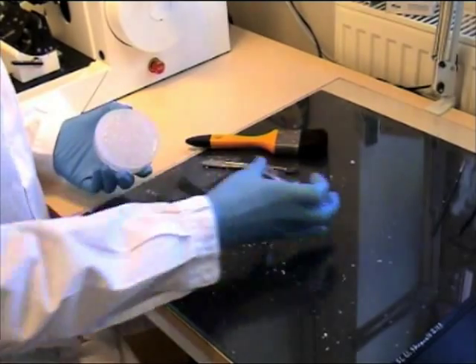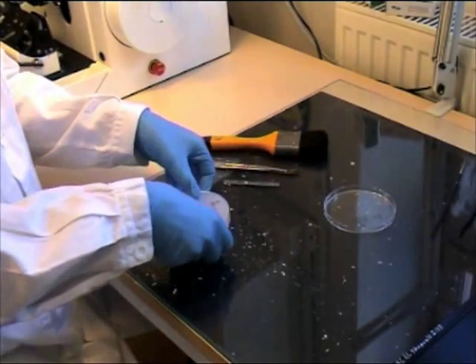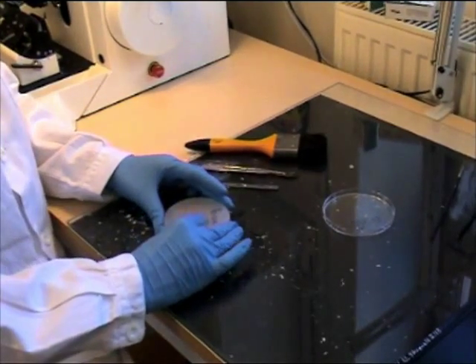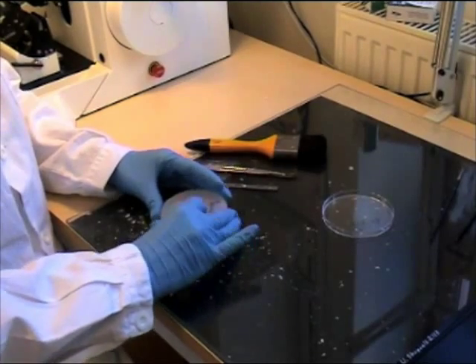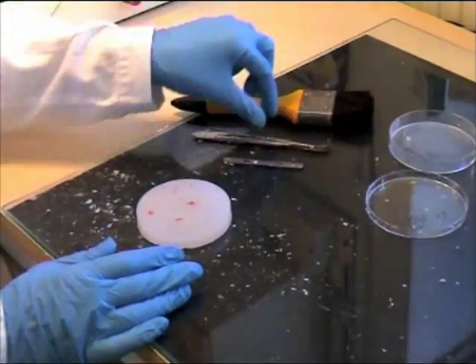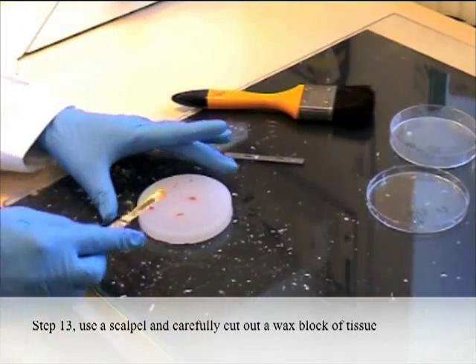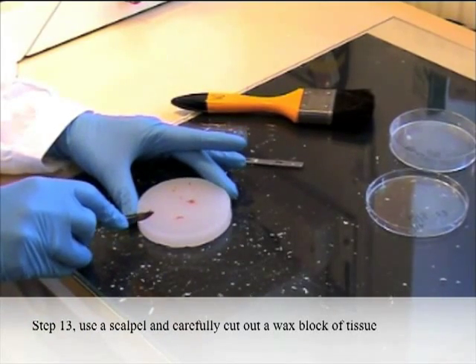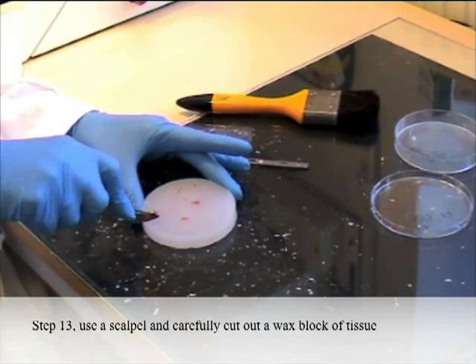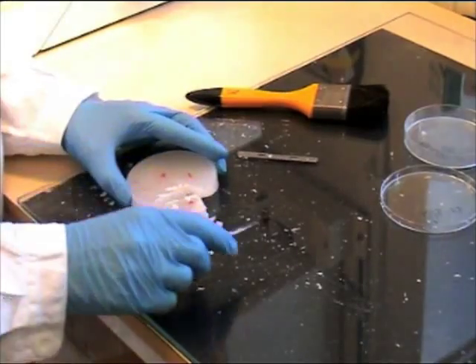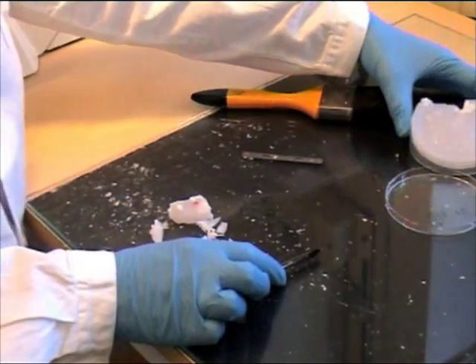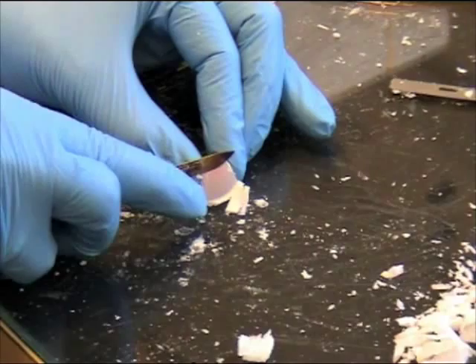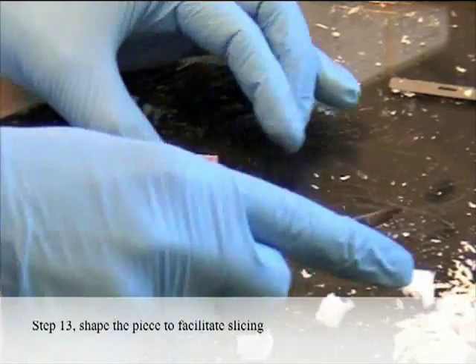Turn on the hot plates and have melted histi-wax available. Take out the samples from the cauldron. Step 13: Use a scalpel to carefully cut out the wax block of tissue. Shape the piece to facilitate slicing.